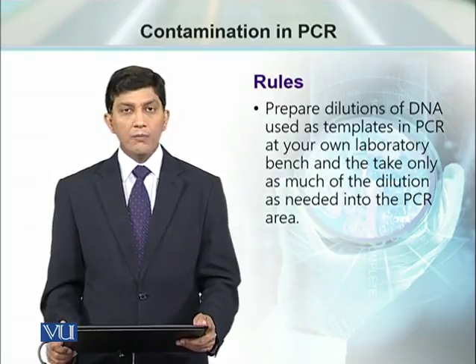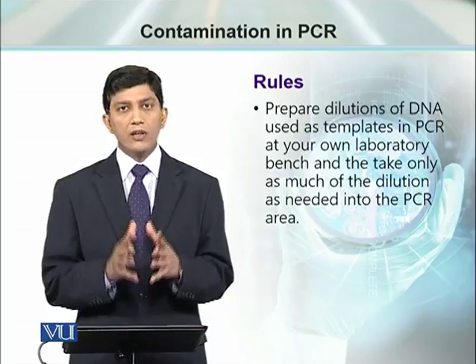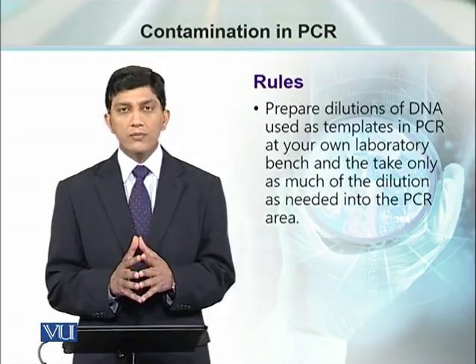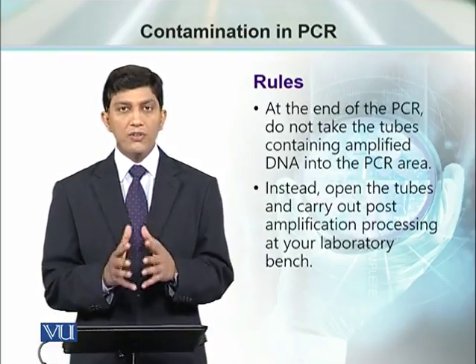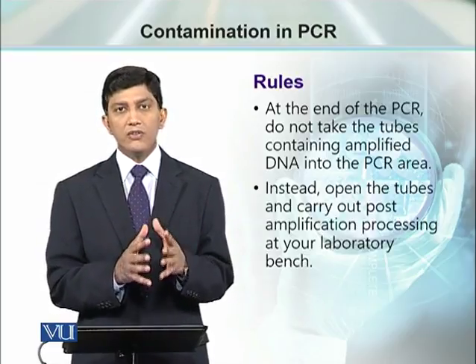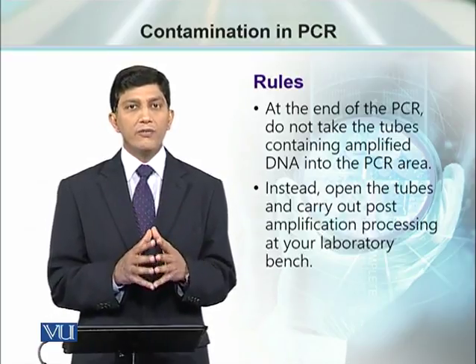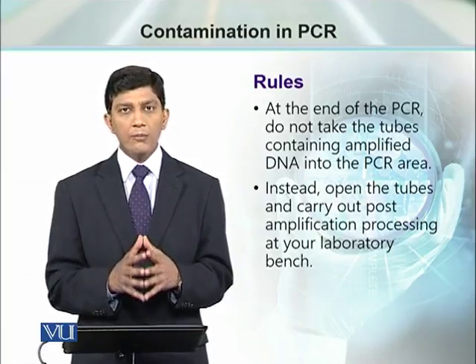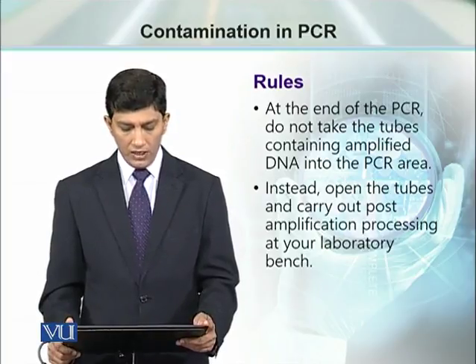While making preparations of DNA to proceed with the PCR, you can prepare the dilutions in your lab on a working bench. However, once amplification is done, the amplified DNA from the PCR should not be processed in the PCR designated area. Process that DNA further for experiments like gel electrophoresis in the lab within your work area or working bench.